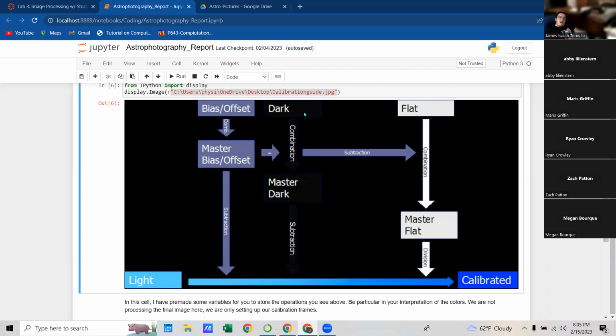So Abby mentioned a photon count in darkness. She also just said that the temperature of the camera makes a reading of photoelectrons. This is true. All right, so let's start from the basics. What's a photoelectron? If you think about the atoms in the CCD chip, each one of those atoms has some electrons in them.